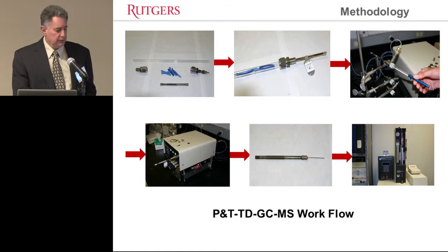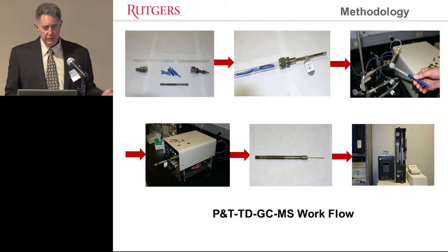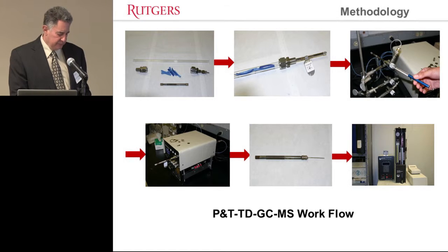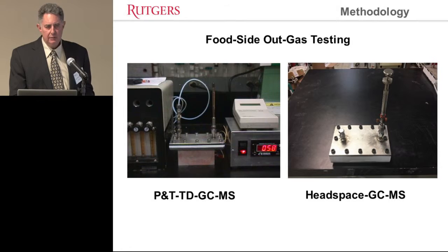With both of those techniques we can do the front, back, sides, every part of the sample. Sometimes you want to know only what comes out of the food contact surface, so we have cells that can orient the analysis. This is purge and trap with a migration cell, with a strip plate heater and a temperature controller connected to it, so it's only the food side. We can do the same thing with headspace. You can put samples in here, put it in an oven, heat it up, and inject the sample. We just did this a little while ago. Sometimes you can make a pouch out of the sample and seal it, fill it with nitrogen gas, then glue a septum to it and measure right from the pouch the same way.